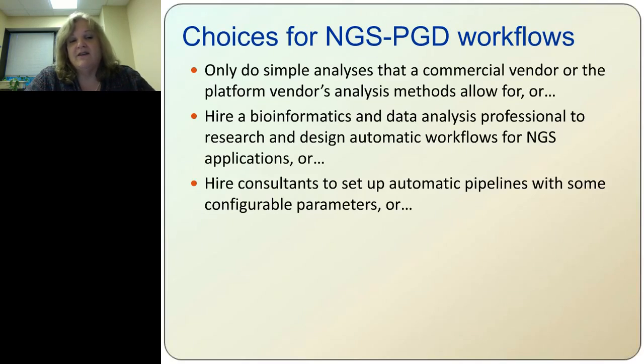Or you could hire consultants. There are plenty of good bioinformatics teams out there that can help you put in place a pipeline. I've worked in organizations that have done that before, where the pipeline would be more of a work-a-day thing. They can come in, install a pipeline, validate it for you. It costs money, but they're often available for updates and upgrades. So if you have a good relationship with that kind of person or group, it can be useful for your organization, and you're not tied down to one particular product. And they have a lot of experience, so you leverage that too.